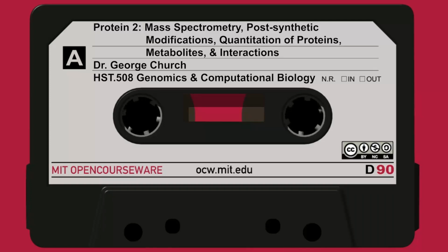There were many moving parts in that experiment. There were all those different dimensions, and the whole experiment was not designed to be quantitative. There were no internal controls, and so forth and so on. Nevertheless, this is a good starting point for convincing yourself or determining whether something is reproducible enough that you can make it quantitative.